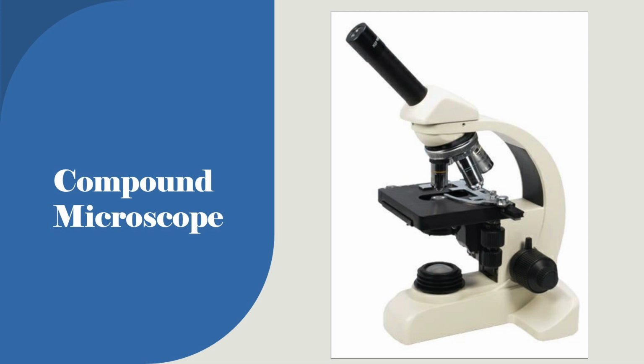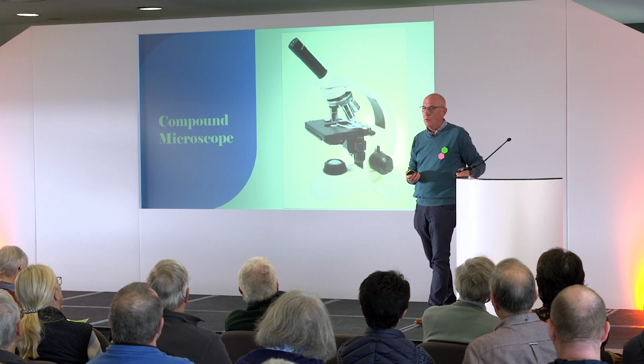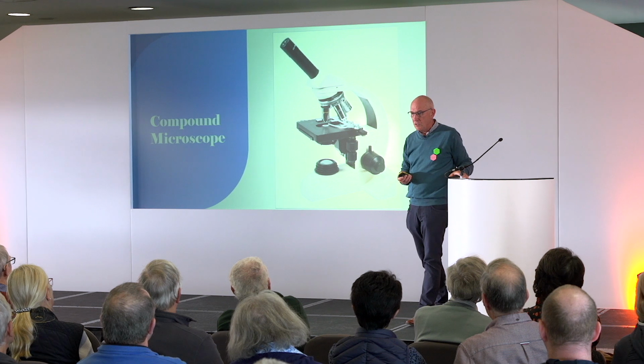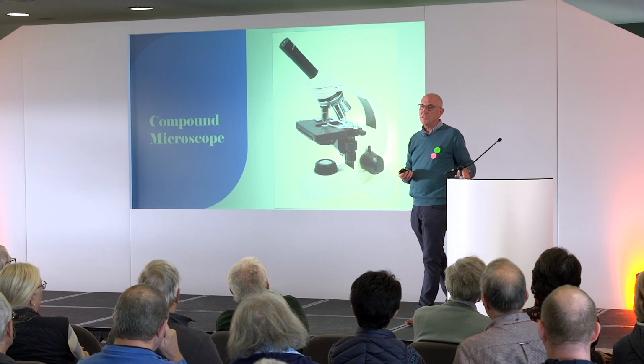microscope. My very first experience of microscopy in beekeeping was when I was the apiary manager at my local association, and the chairman said, we want to do some Nosema testing. You can run it, Sean, because I'm on holiday. Here's a microscope and slides. And I said, well, I'm always up for a challenge, I'll try it. And I didn't find one Nosema all day.